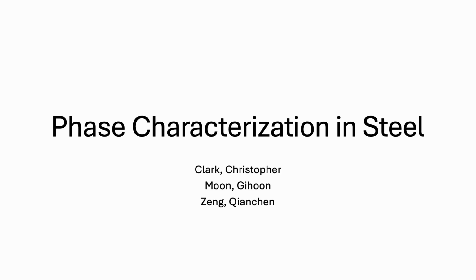Hello everyone, my name is Ki-Hoon Moon and today we're going to present our project on phase characterization in steel using X-ray diffraction. In this presentation, I will explain the basic principle of XRD, how the machine works, and its application in identifying the different phases in steel. As you know, this technique is essential for material science, especially in understanding the crystalline structure of metals and alloys.